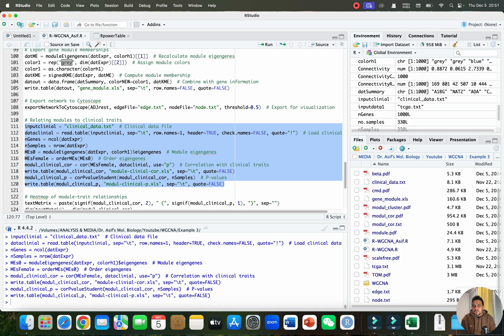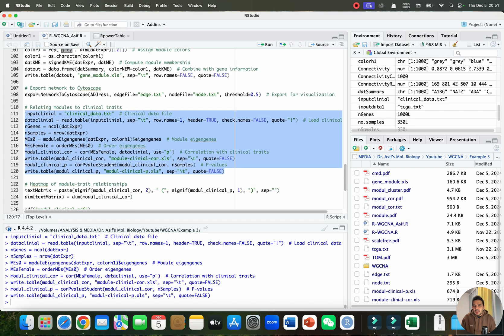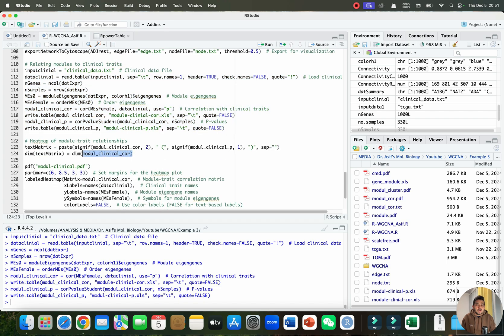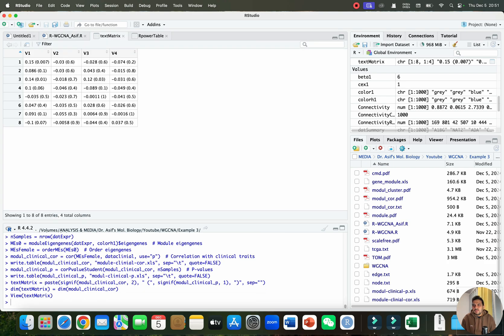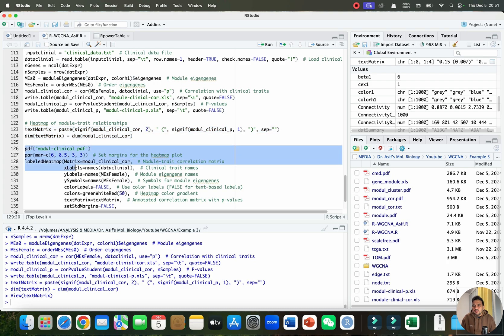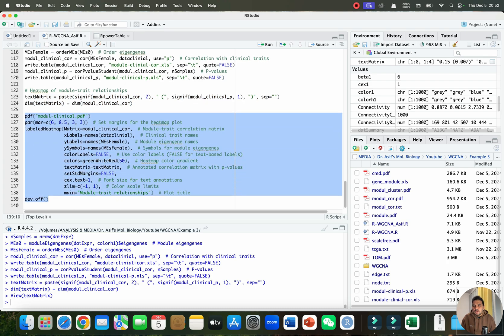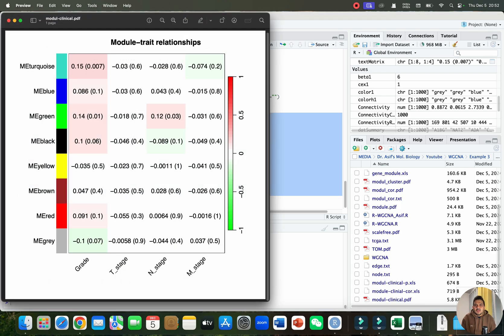To create the module-trait correlation, we need to relate the modules to clinical traits. The module-clinical correlation is saved as an Excel file containing p-values and correlation values. To generate the heatmap of module-to-trait relationships, we run a simple code with the test matrix containing V1, V2, and V3, save it as a PDF, and run it. The resulting plot shows the module-trait relationship heatmap.